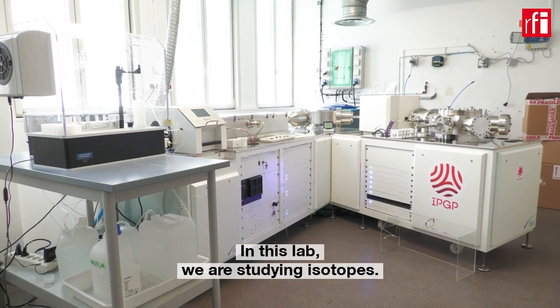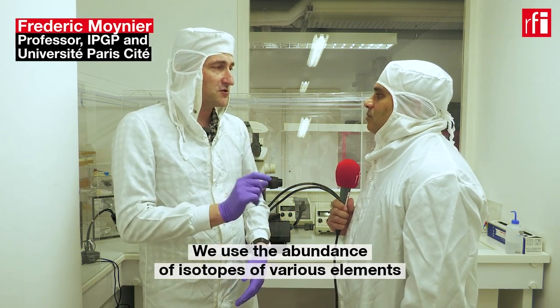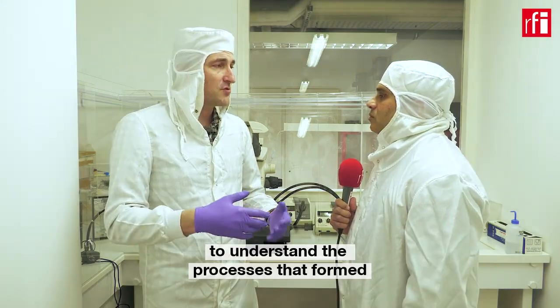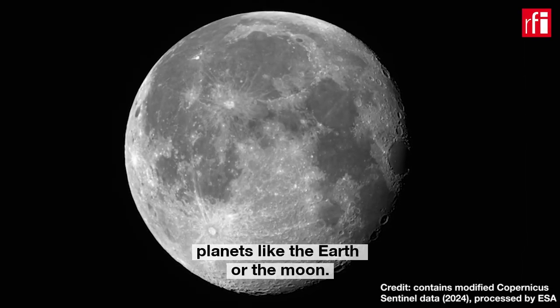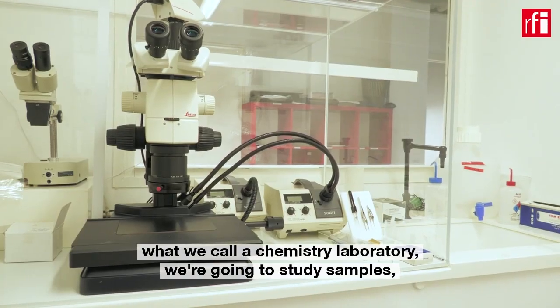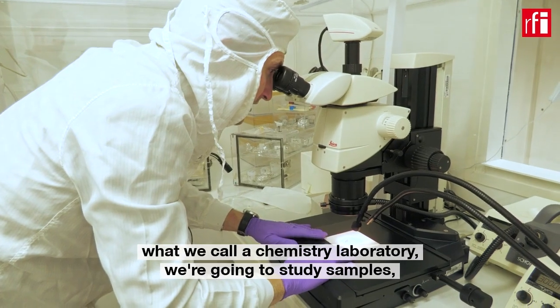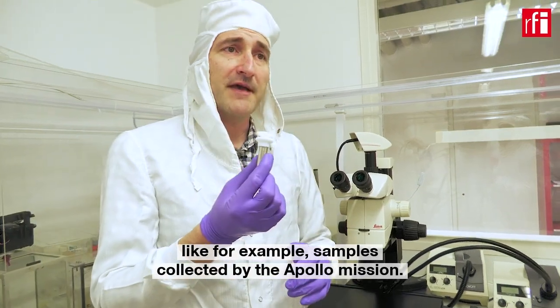So here in this lab, we are studying isotopes. We use the abundance of isotopes of various elements to understand the processes that have formed planets like the Earth or the Moon. For example, here in this room, we are in what we call a chemistry clean laboratory. It's where we study samples like, for example, samples collected by Apollo missions.